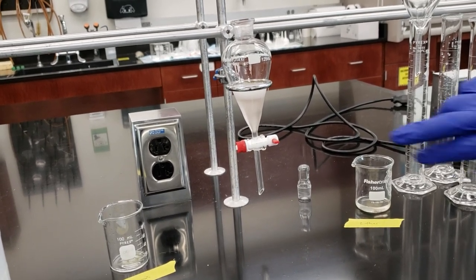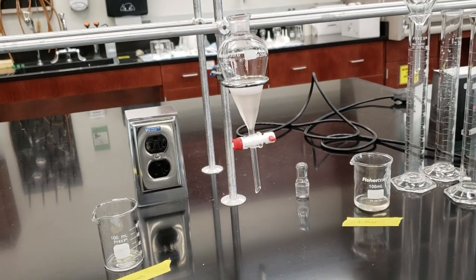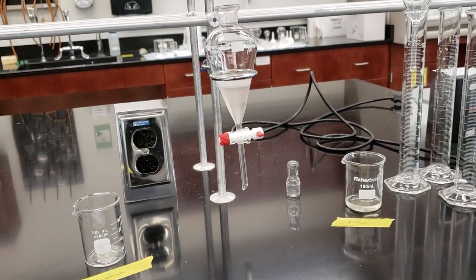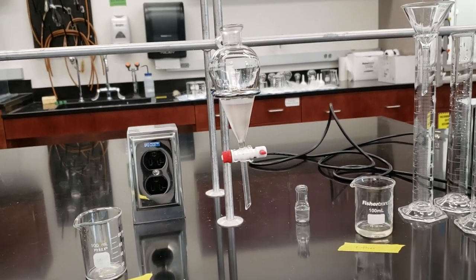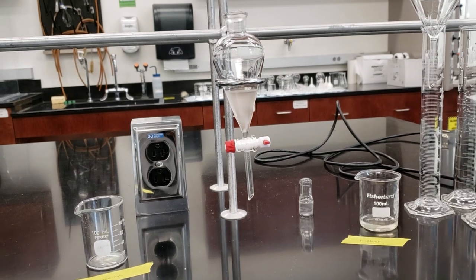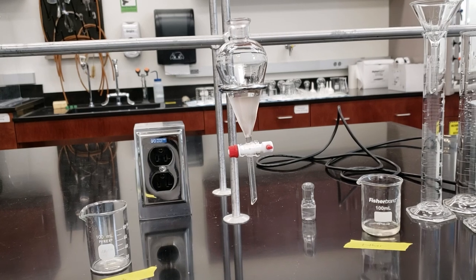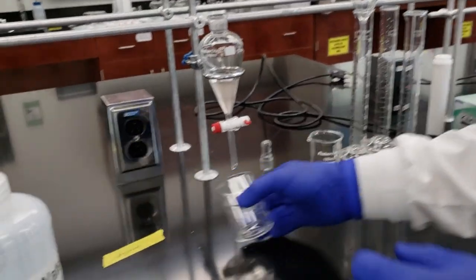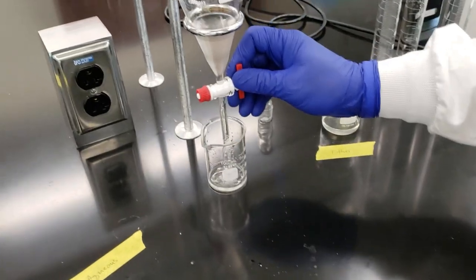What we're looking at here is little tiny droplets and bubbles that form in the ether layer. As they clear, they're popping and releasing that aqueous layer. So we see a clear separation between the two. The interface between the two is clear. We can see our layer separation. So now we'll go back and drain off our aqueous layer, the lower layer, just as we did before.